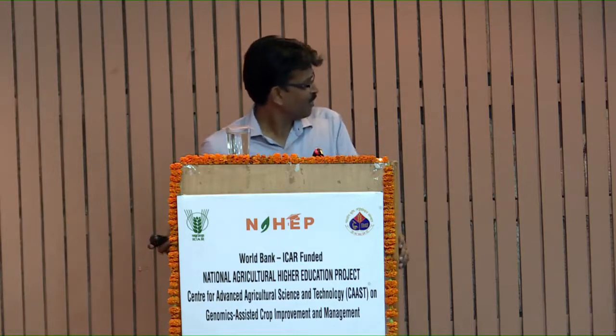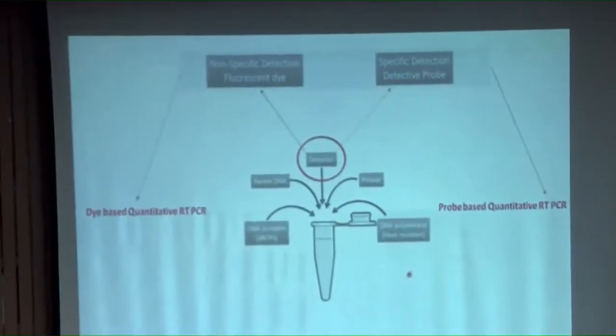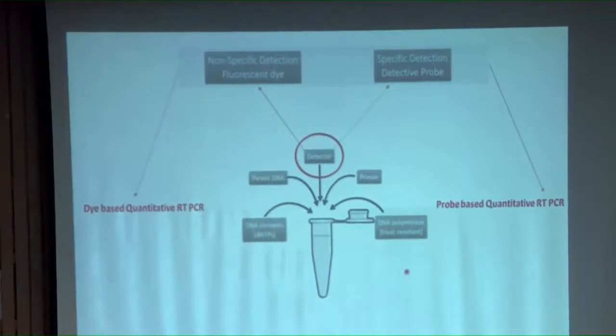Nothing wrong in that, correct? Now, these two independent methods of PCR monitoring are aptly named dye-based quantitative PCR, if you use dye directly in the PCR mixture, okay? And you have another parallel technique, called probe-based quantitative real-time PCR. It's slightly different from the dye-based one.